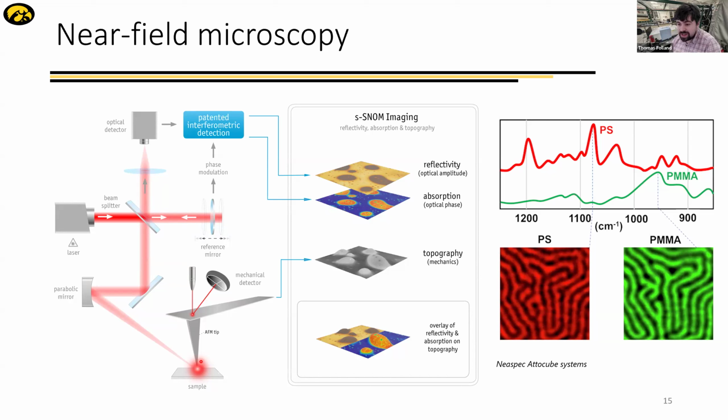So this is really cool because we can shine, say, a wavelength of laser with 10 microns on our tip. And because of this nonlinear interaction, we can actually get spatial data about the reflection of the sample and absorption of the sample to 10 micron light at a resolution on the order of 20 nanometers. So we can go way below the diffraction limit in doing this.